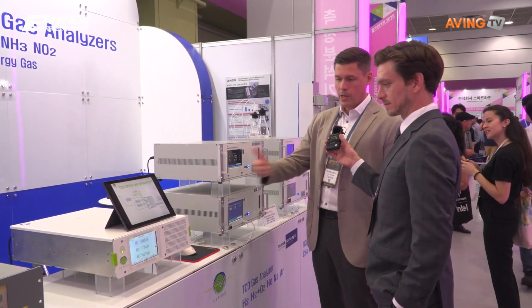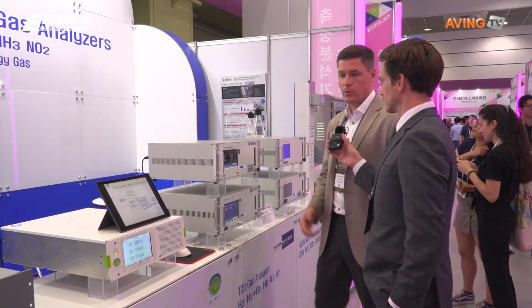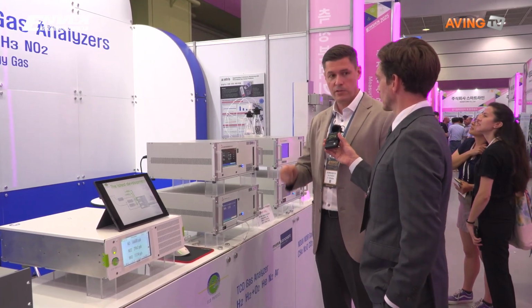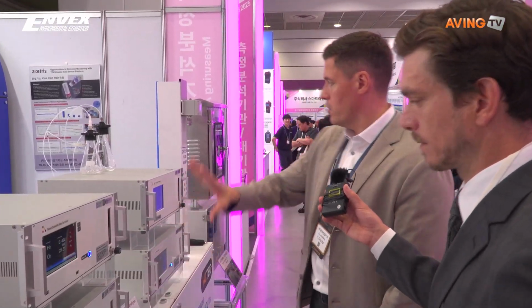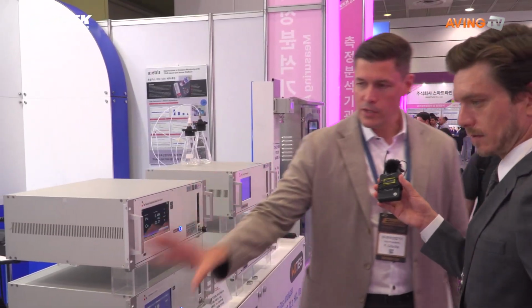And that is basically where we come into the Korean market. Emission control is a highly politically sensitive subject here. Yes. And that is why we went into the market right here, because this is a huge opportunity for us to implement our new analyzers together with Kinsco as our system integrator into the Korean market. This is one component of many. Kinsco is offering the entire portfolio for all the components. This is the one focusing on the nitrogen-based gas components that we detect.